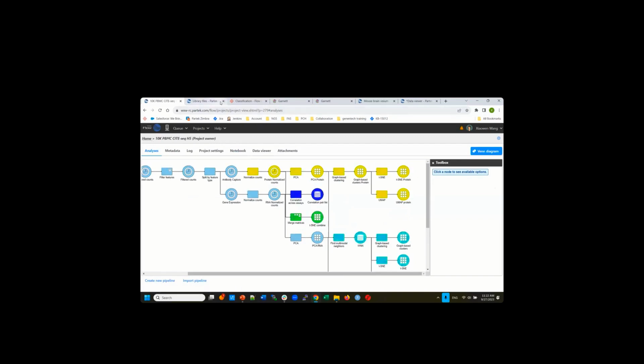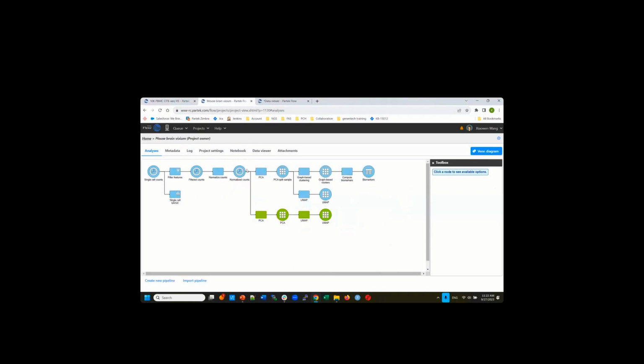The other example I want to show you is the spatial transcriptome. In my understanding, spatial data also gives you the morphology context to help you identify your cell type. It's because t-SNE and UMAP are all dimension reduction. When you map a 10,000-dimension space to 3D, you're going to lose a lot of information. No matter what you look at, you only look at one tiny percentage of the whole information, right?